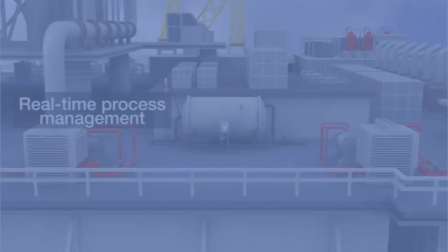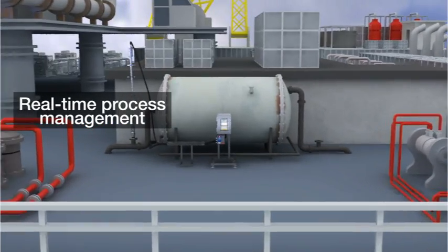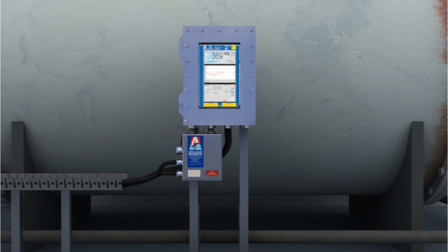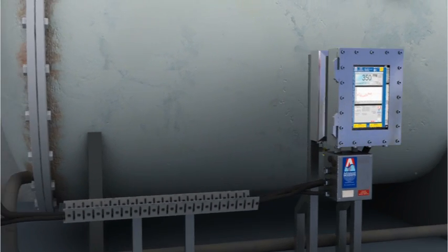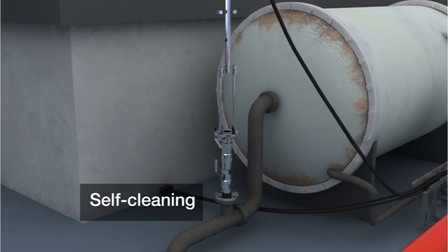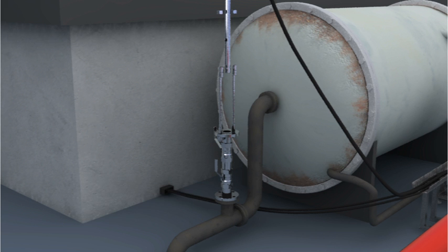Having supplied a world-class monitoring solution with our EX100 range, inline process measurement for process control was the next challenge. Advanced Sensors have developed an inline probe with all the measurement capabilities and self-cleaning techniques as the sidestream unit.